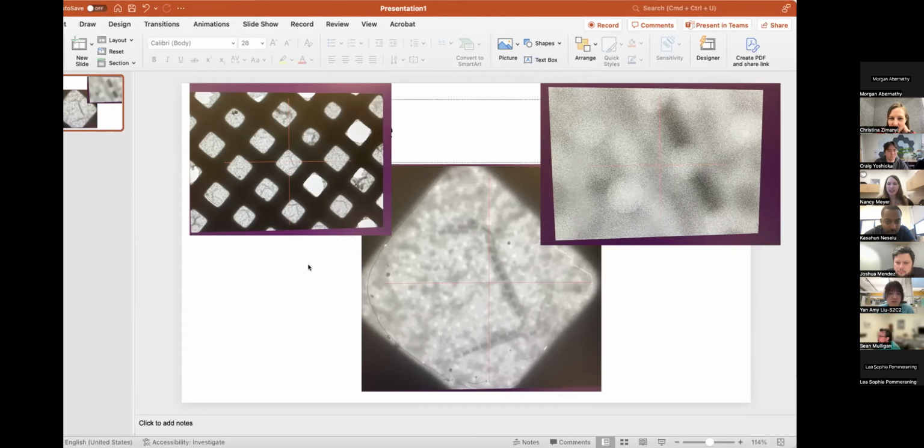I'd say the majority of it is aggregation. If you took a high mag image, like Sean's saying, you'll probably see that it's clumps of protein, most likely. Yes, I did see that in the dark. Okay, cool. Thank you. When aggregation is this severe, it can be difficult to dilute it, so just be mindful of that. You may start diluting and then it all disappears at one point.